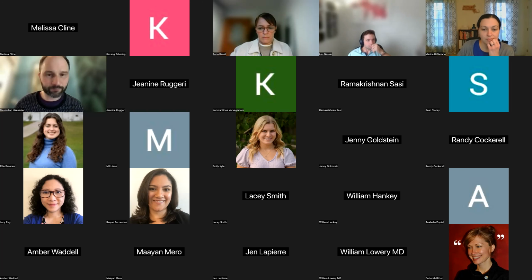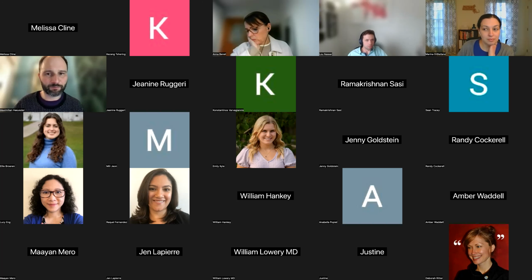I'm always surprised at the number of different ways humans can think to write things. So the work that we'll be doing to structure some of the codes that we can structure now in a computationally tractable way, we will be focusing on those. So hotspot data is one. Another one, of course, is the BA1, BS1 cutoffs. We have a couple of ones that we're looking at to try and structure in a way that we could get it into UCSC quite easily.